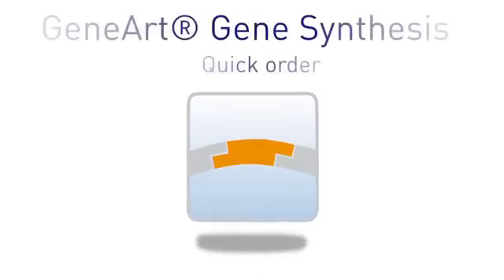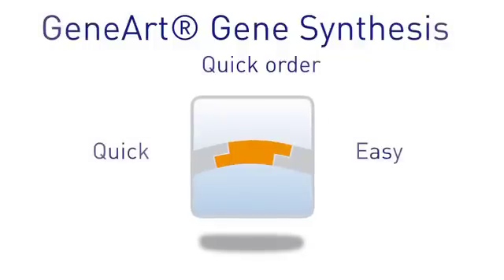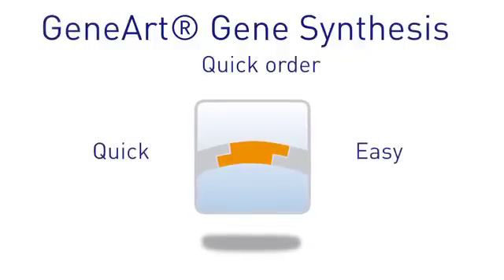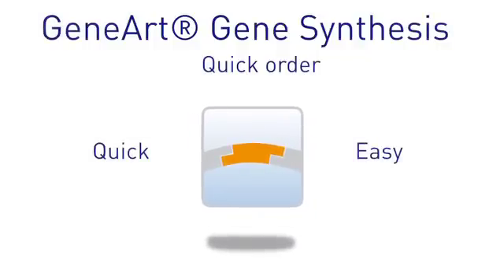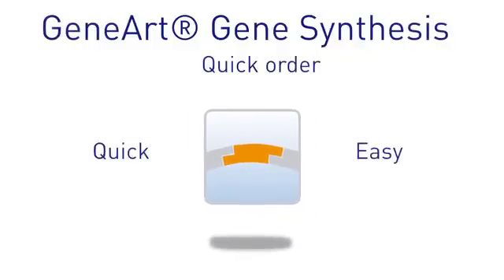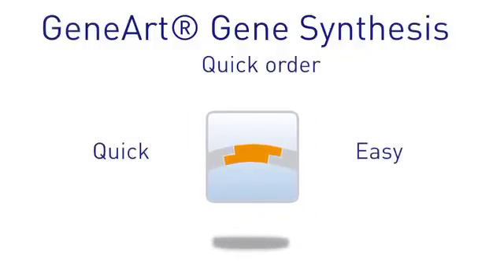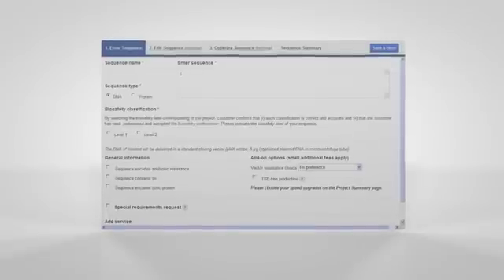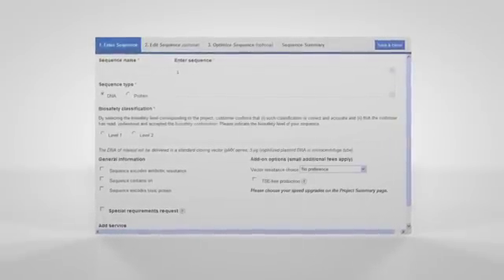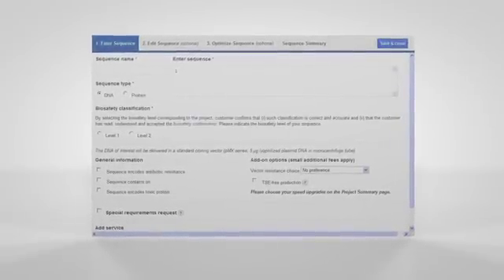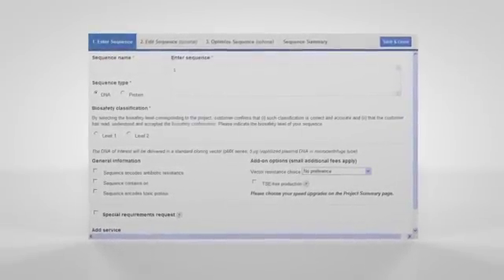This tutorial describes how quick and easy it is to order a sequence which doesn't need any editing or optimization. The Enter Sequence tab of the Gene Synthesis form is the only one required.